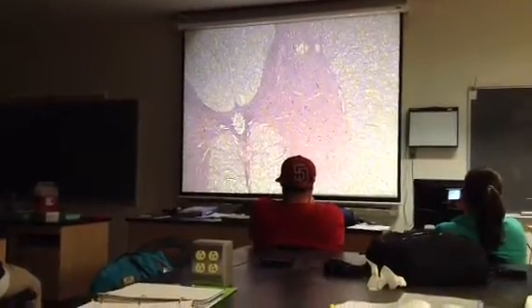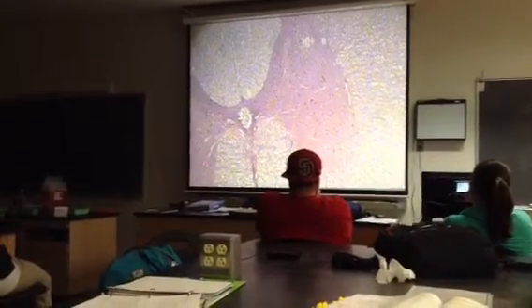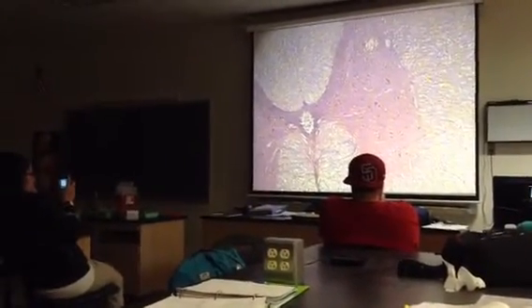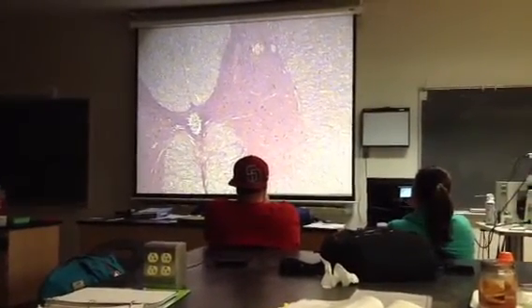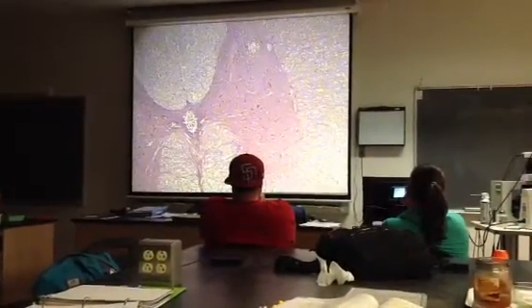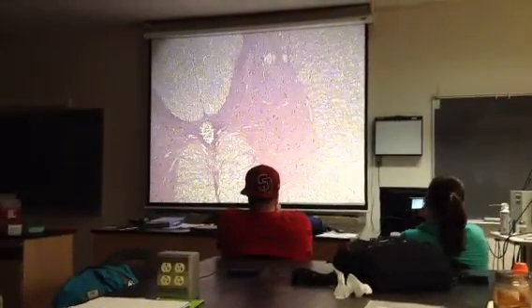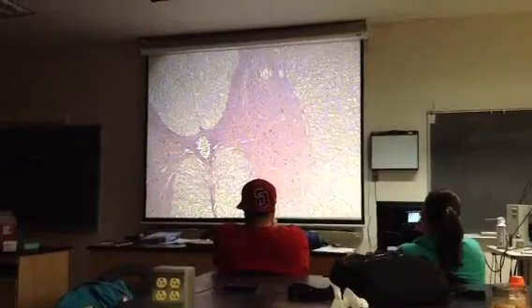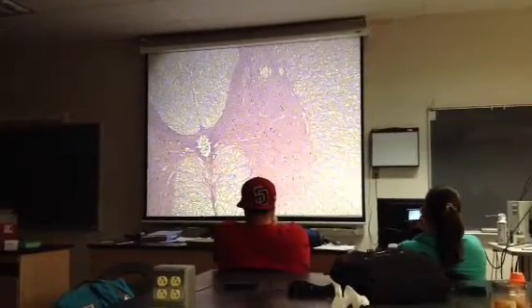Motor. That's motor. And then the lateral, which side are we going to group that with? Motor. Yeah, you're going to group that with the anterior. Remember I said the anterior and lateral are motor, but then everybody kept mixing it up with the white matter. So don't mix that up with the white matter. White matter is a little more straightforward. This is the one that has a little extra part. So anterior gray horn and lateral gray horn are motor.